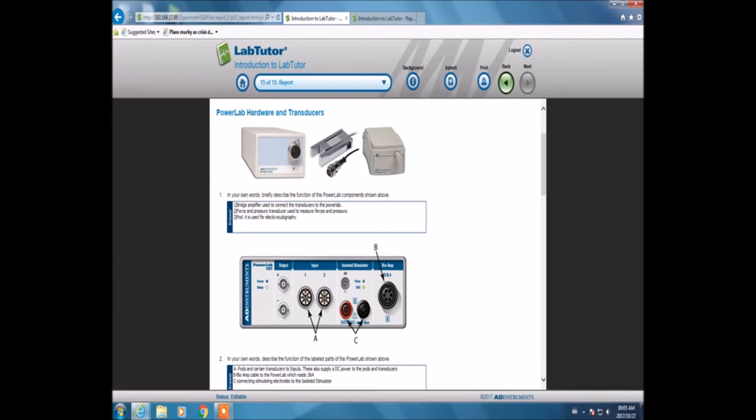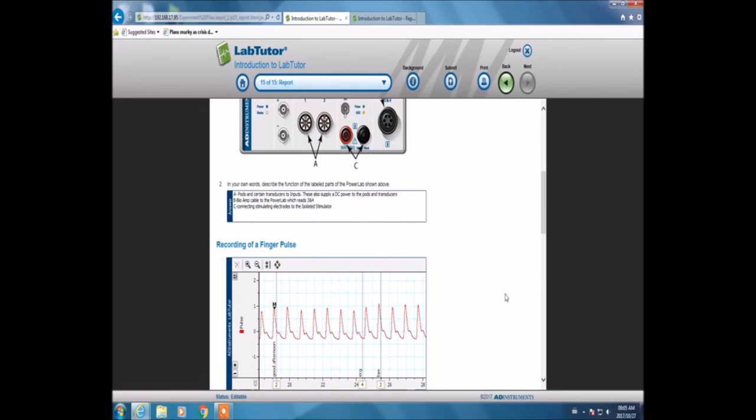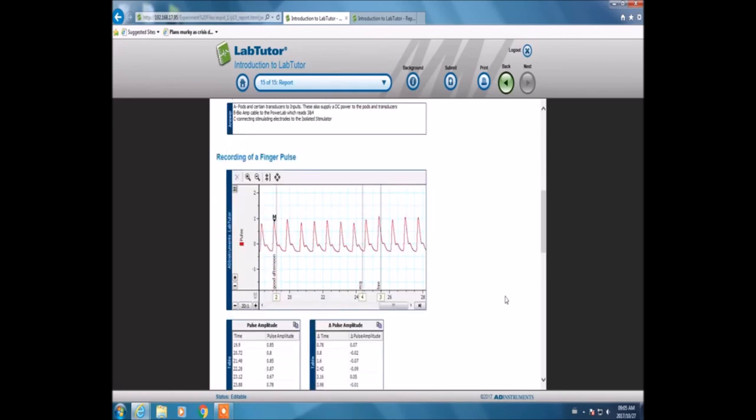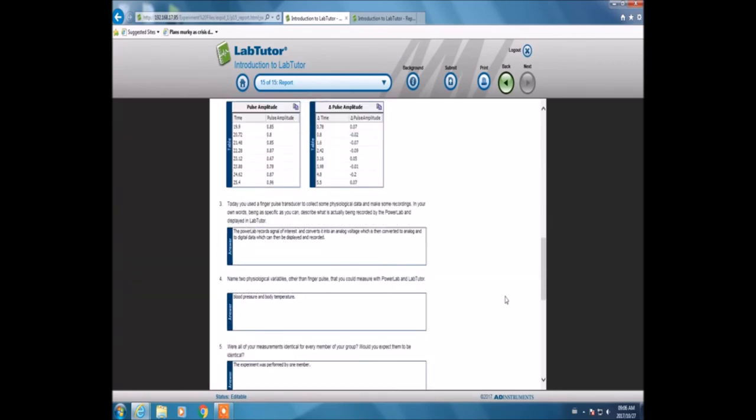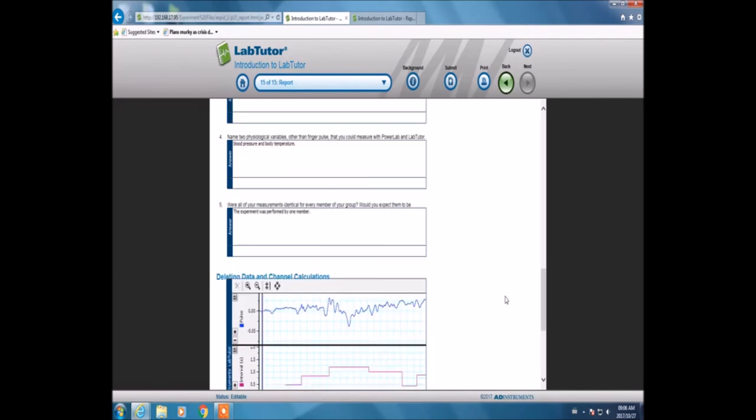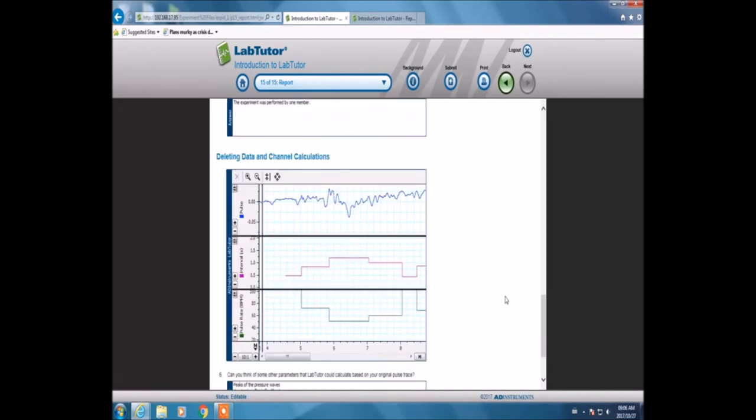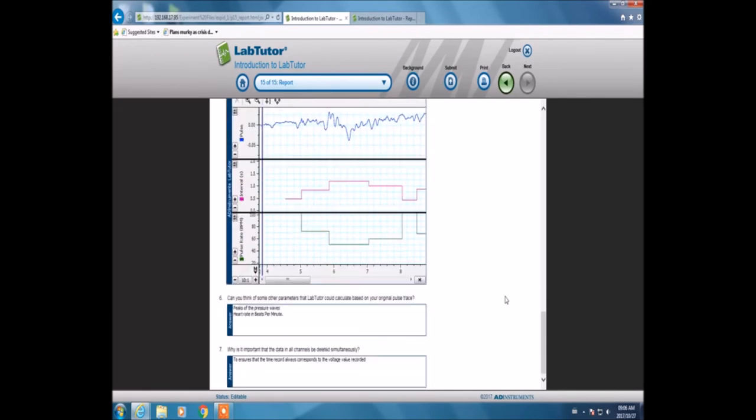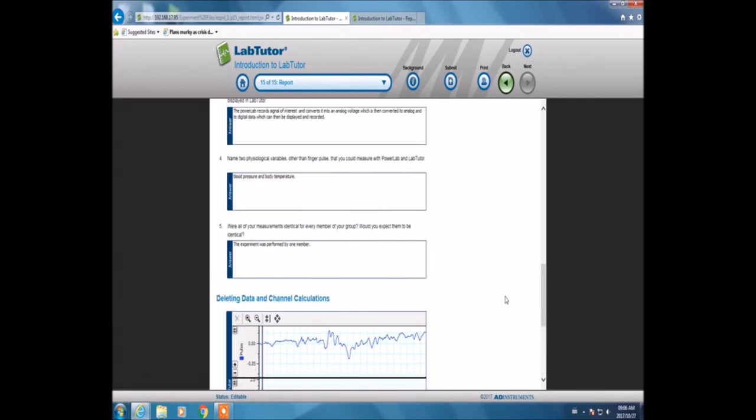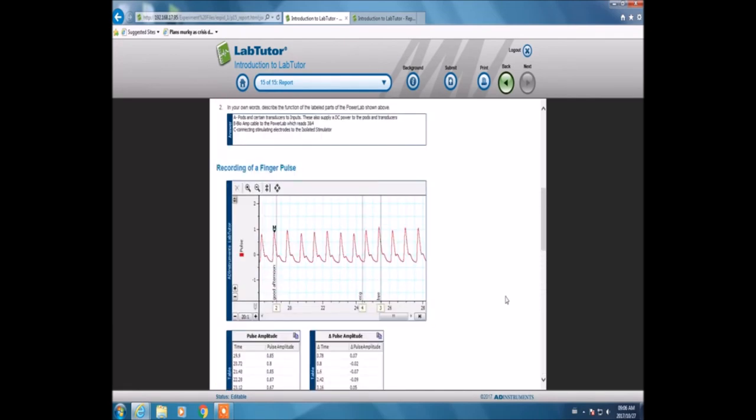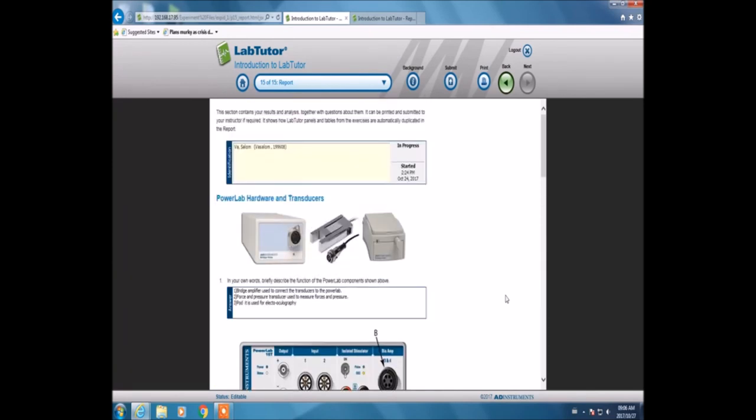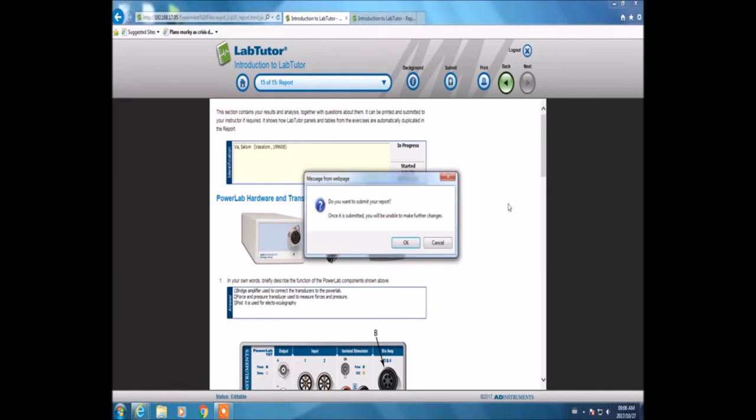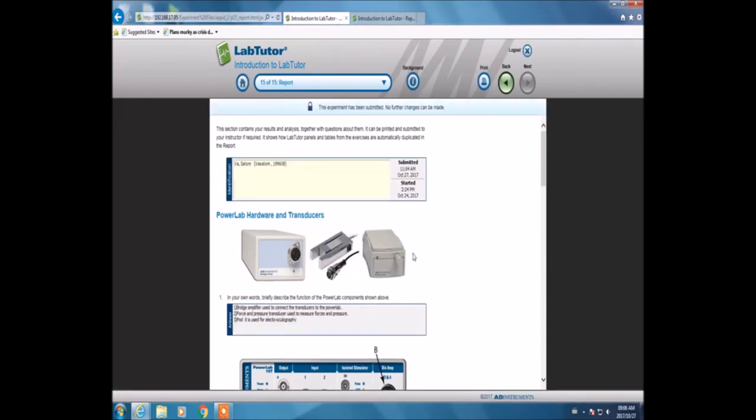After this, you can confirm that you filled in everything by scrolling down and checking that all the gaps are filled in. Then you're required to submit your report. Submission is done by clicking the submit button, then you have to confirm just to make sure you didn't accidentally click it, because after submitting you cannot make any alterations to the report.